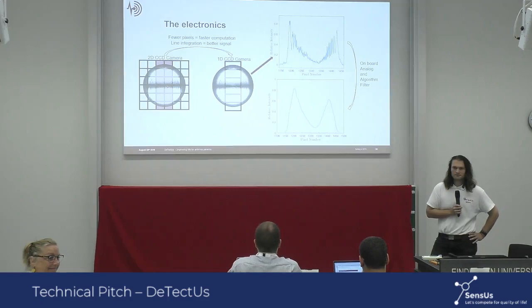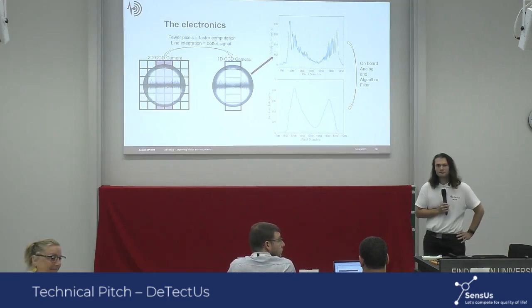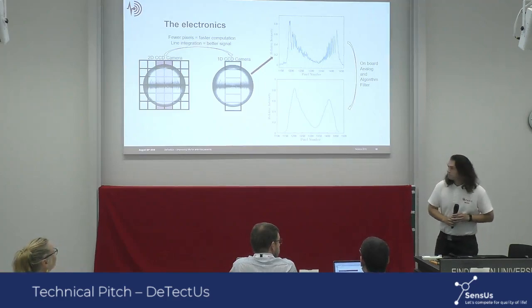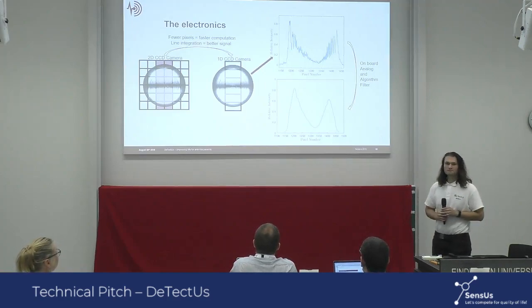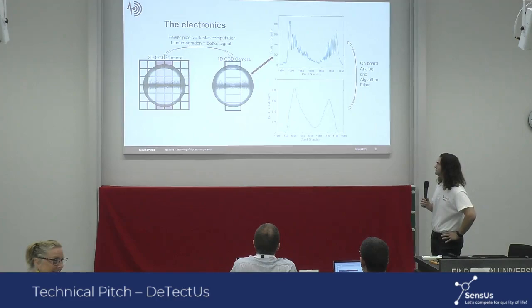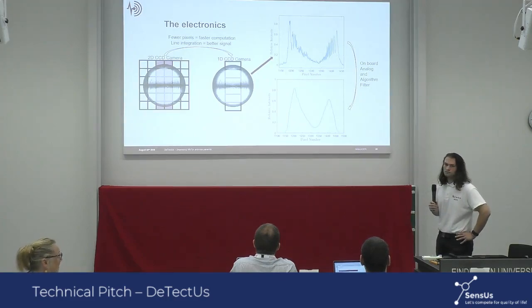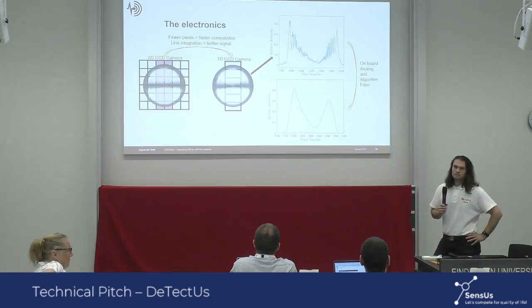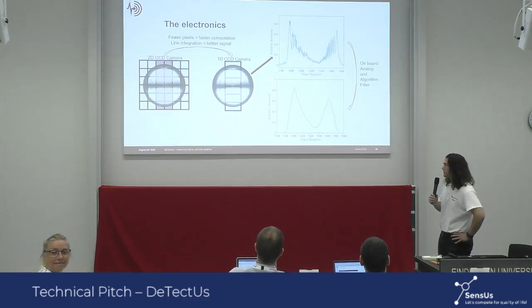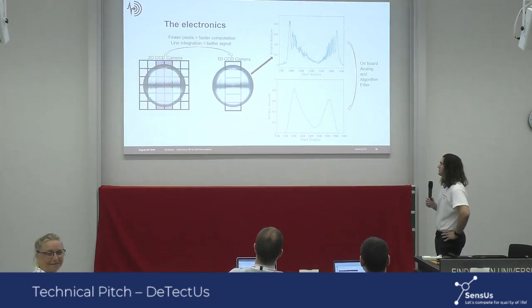A brief question about the detection. If you look at the picture of the CCD camera, you see the width of the figure, the black band. Do you think you will get enough sensitivity to have a reliable measurement in the end? And what do you expect about the future potential of improving the width of the signal?